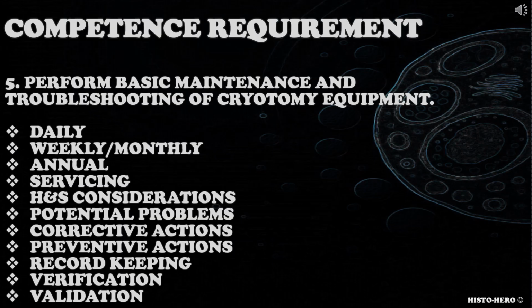When addressing this competence requirement, candidate could consider daily, weekly, monthly and annual maintenance, need for servicing, health and safety considerations during maintenance, potential sources of problem equipment, corrective and preventive actions that can be introduced to prevent problems, record keeping, verification, validation and so on.